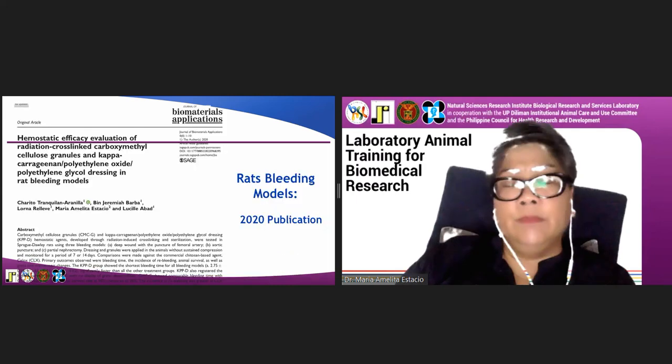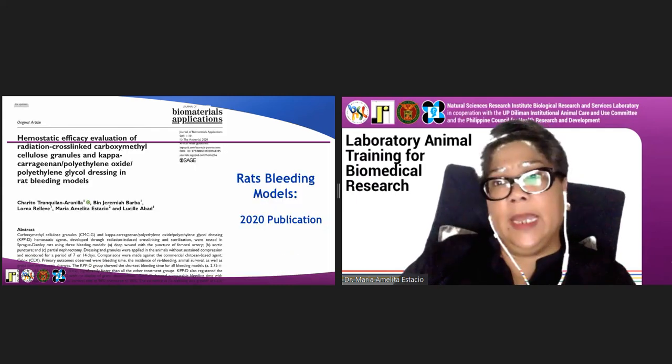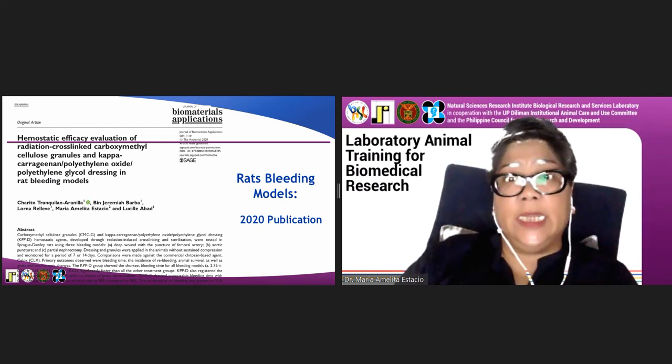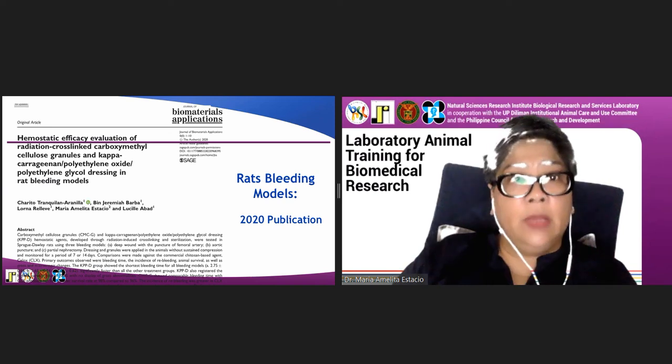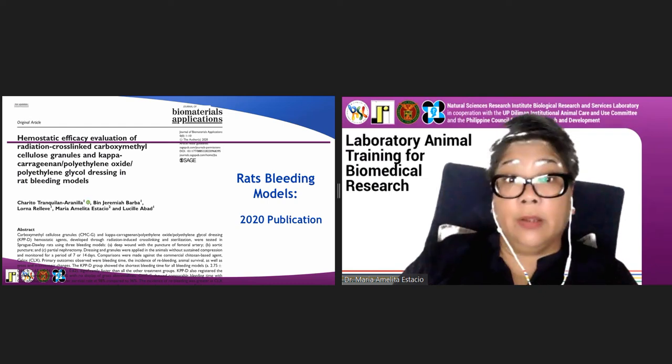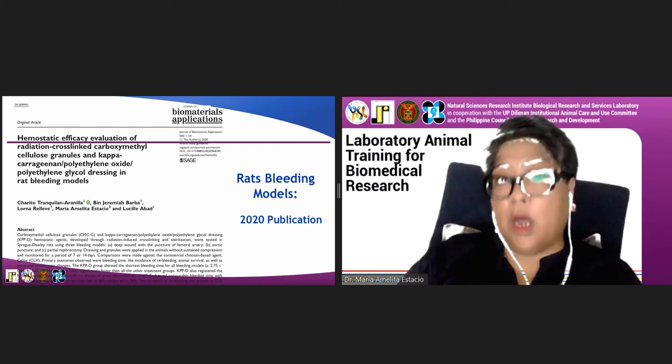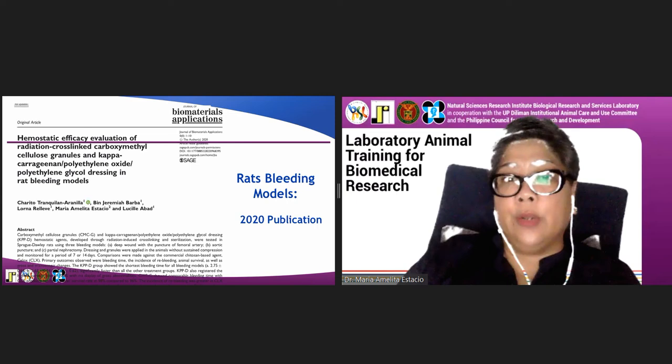So just to show you again, I'm sharing with you our success in the use of animal models. This is a collaboration that I did with the Philippine Nuclear Research Institute, the group of Ma'am Chat Aranilla and Dr. Lucille Abad. They developed a hemostatic medical product to address bleeding.